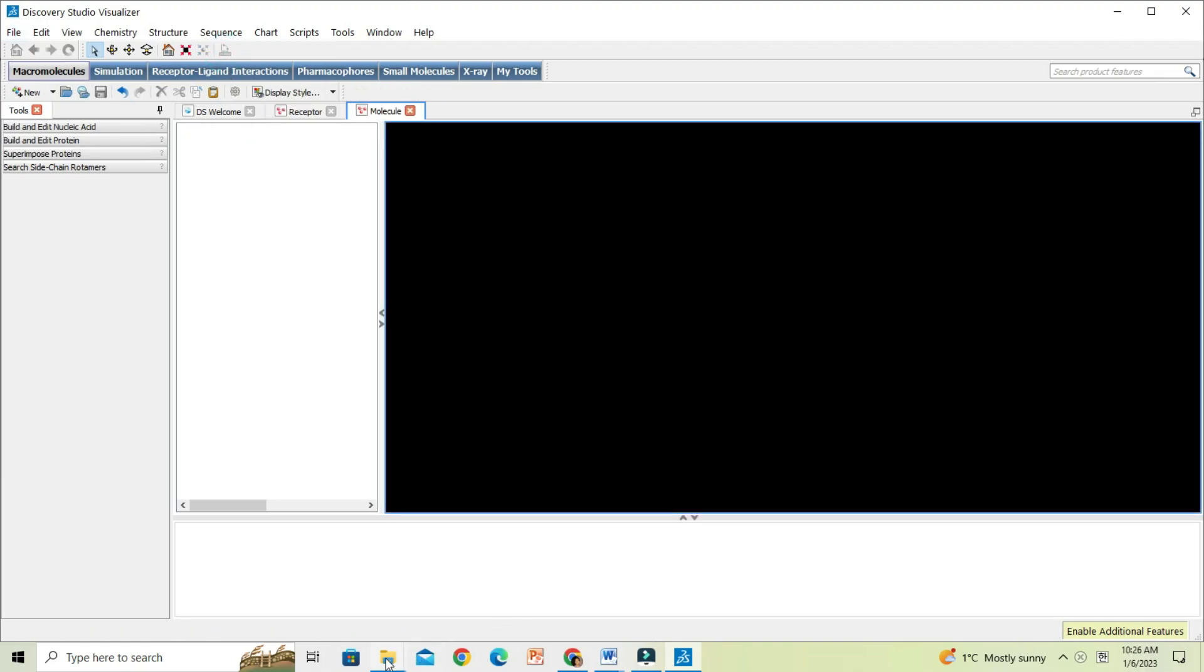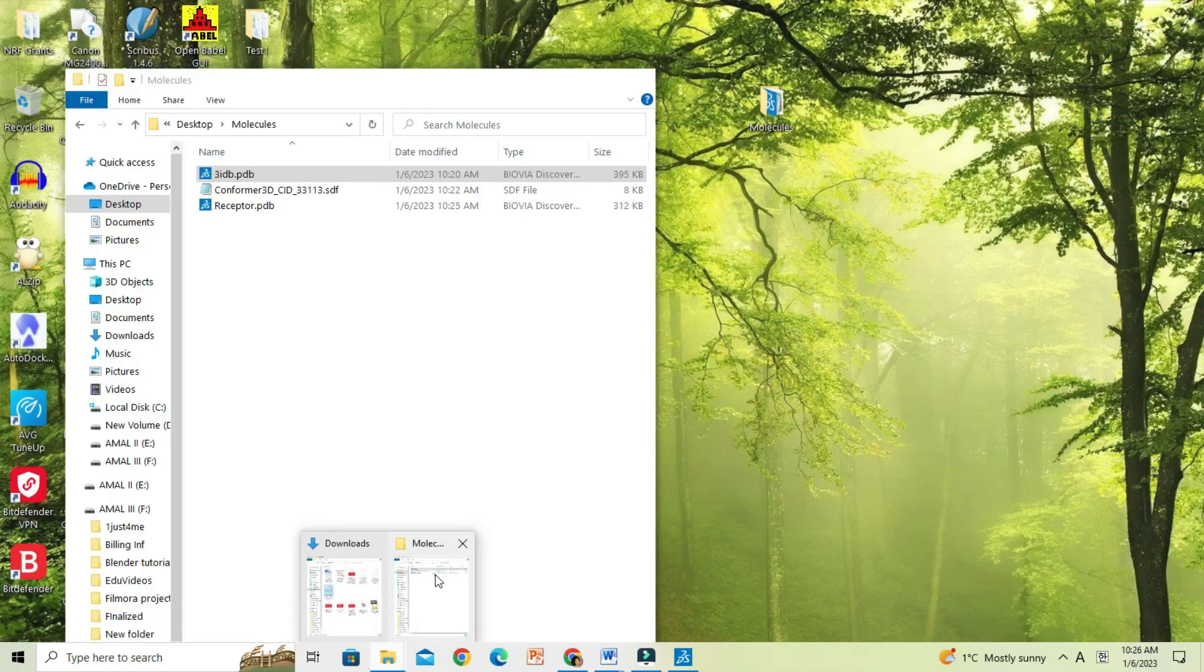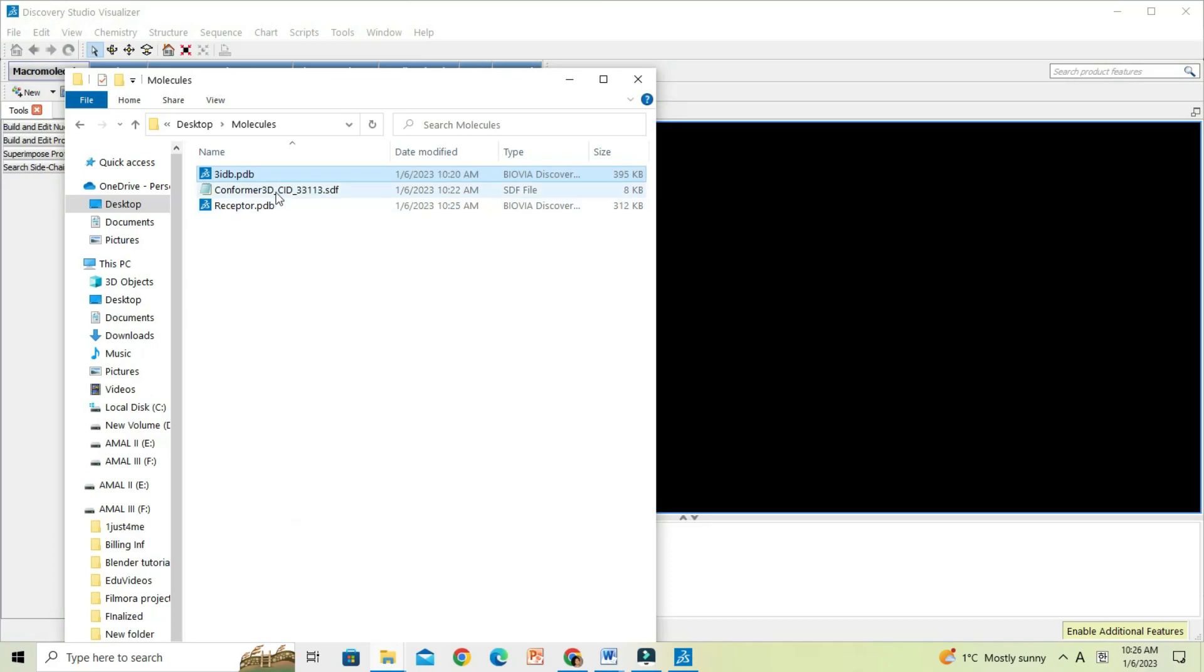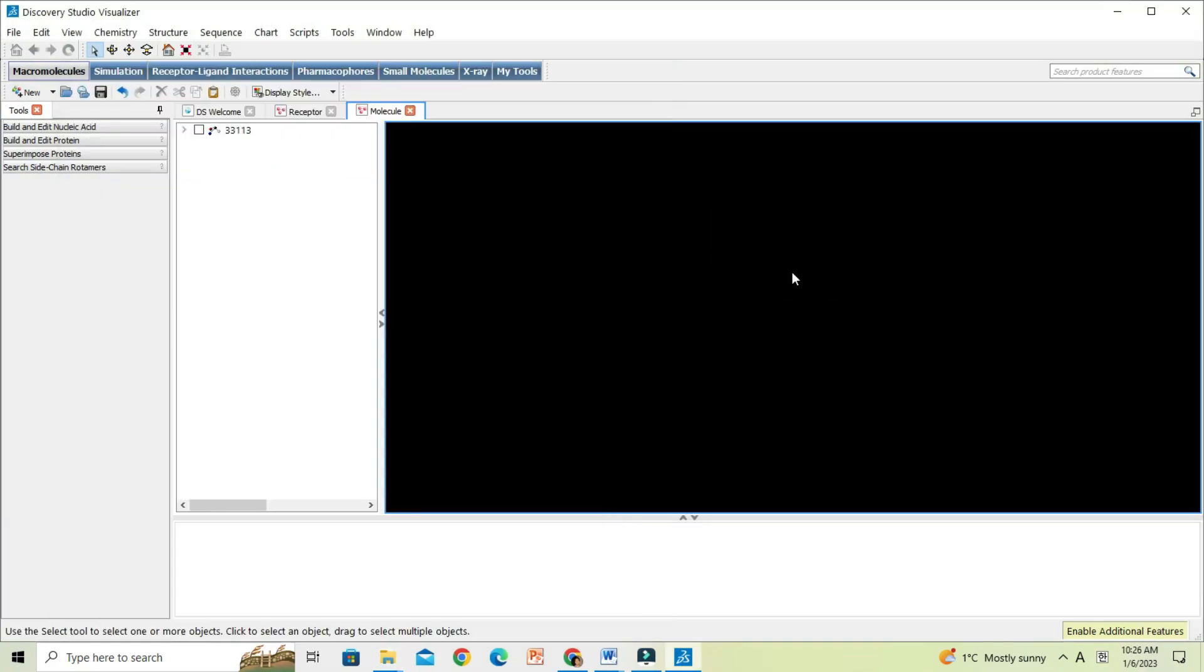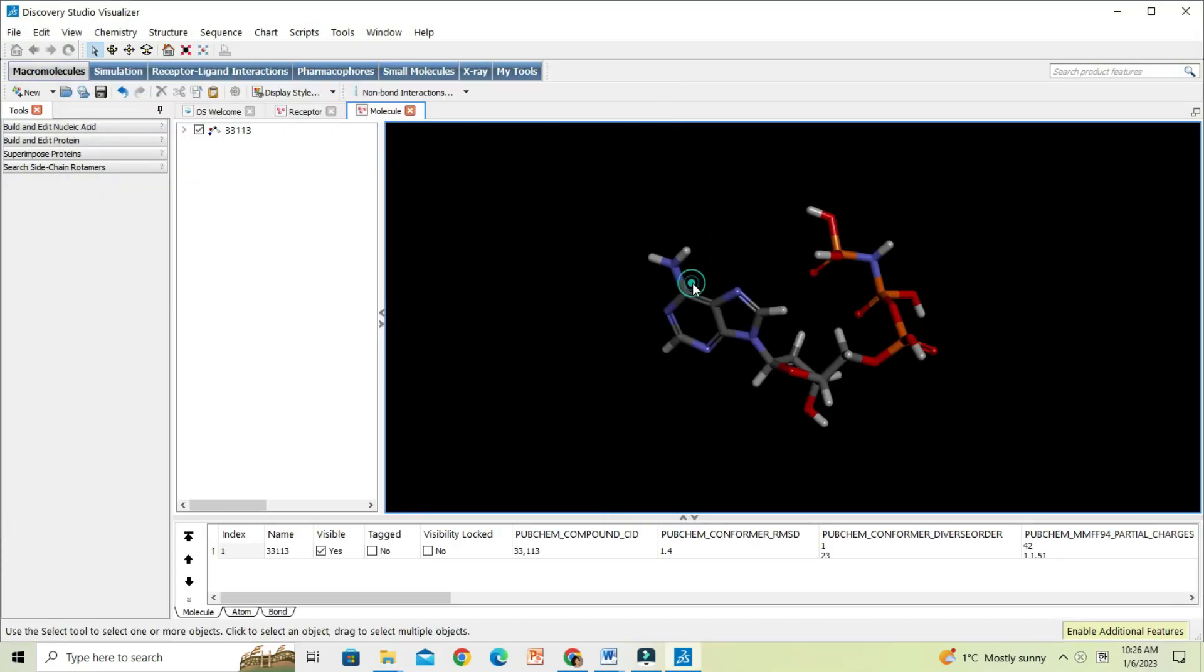Now we can drag open the ligand SDF file in the same manner and just save it as PDB file.